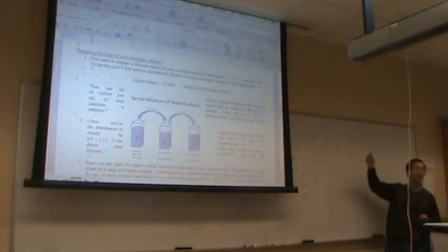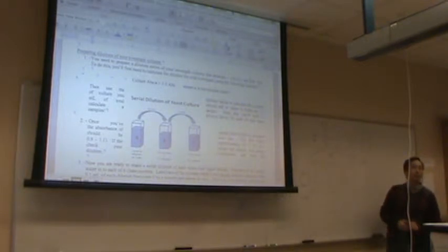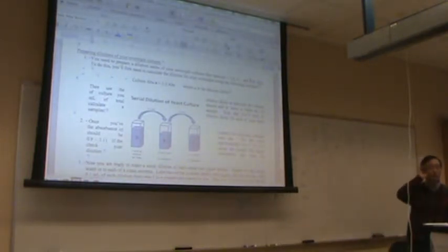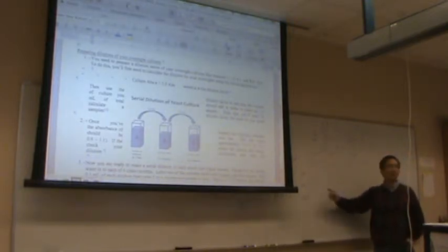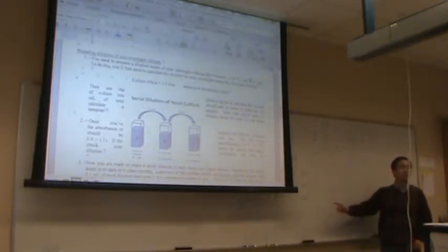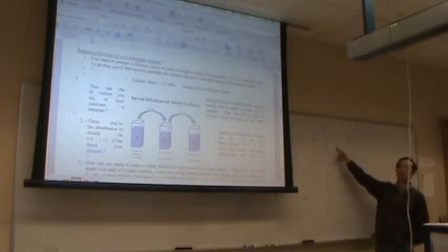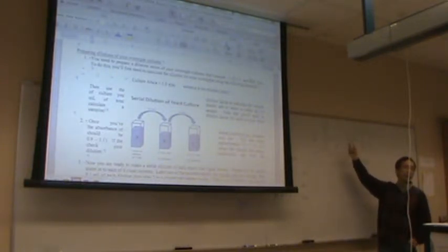Do we need to mix these up? Yes, we need to mix the cell solution. But each sample is in a separate tube, we're not mixing those things together. No, I was just asking do you want to shake those small tubes so that the solution, you know, water is mixed together, make sure the cells all go into the water.